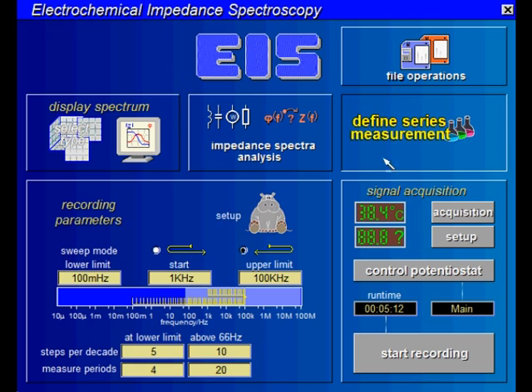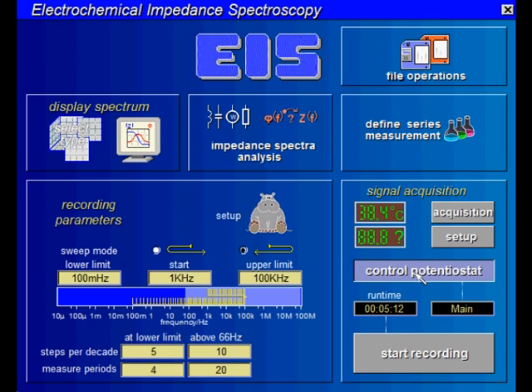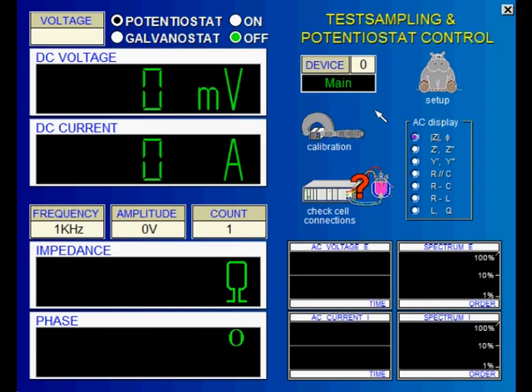Here we first call the control potentiostat page in order to set the parameters related to the potentiostat and check the external cell connections. This display box shows the open circuit potential OCP with the potentiostat switched off. When the potentiostat is switched on, the DC voltage or the DC current is displayed here.